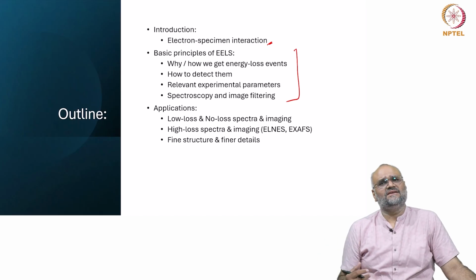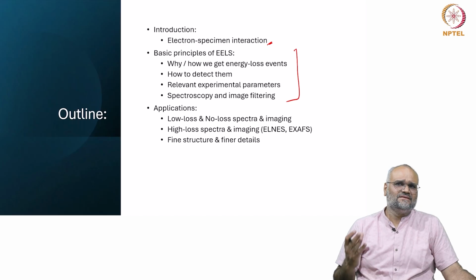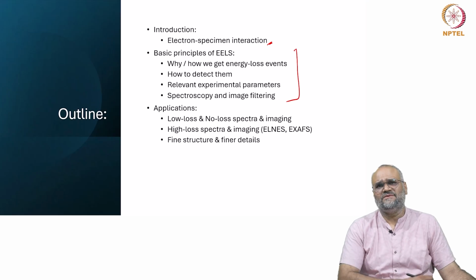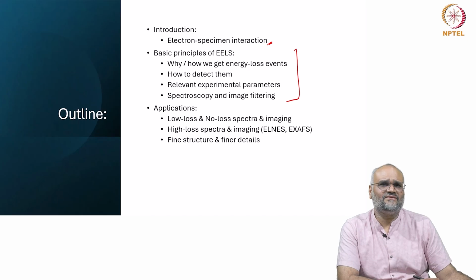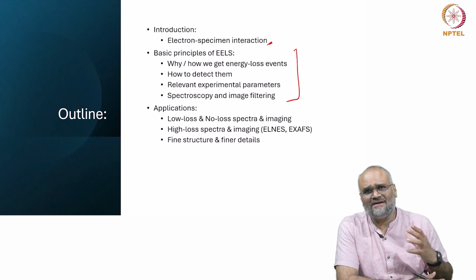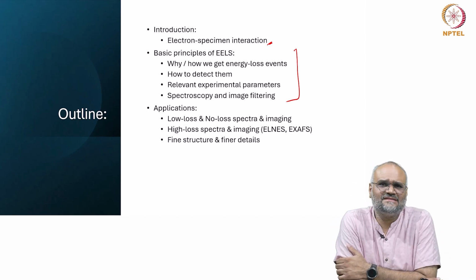Depending on the technique you're using or the tool that you're looking at, the specifics might differ from instrument to instrument. Traditionally, there has been only one company manufacturing the post-column EELS detectors. It is called the GIF, the Gatan Imaging Filter system. I will focus on what I've learnt, or the sequence of operation, based on this particular imaging filter system.